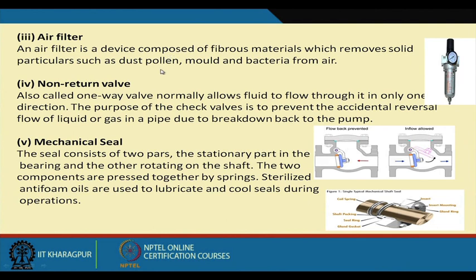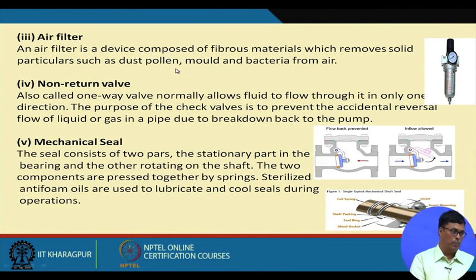For the removal, we use different types of fibrous filter, particularly glass fiber, for the removal of the pollutants and particulate matter present in the air. That is largely used. This I shall discuss in detail when I discuss upstream processing, where I have taken into consideration both air sterilization and medium sterilization.